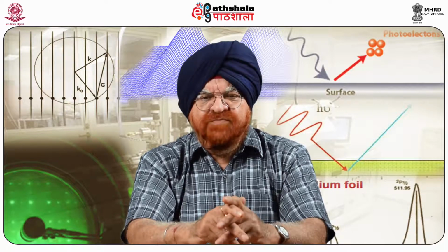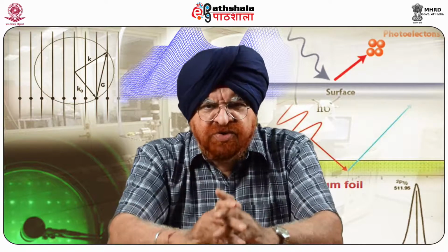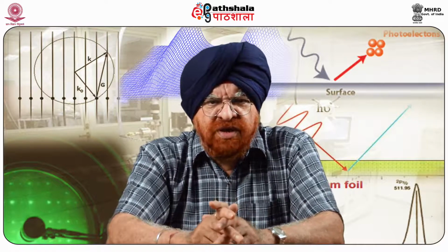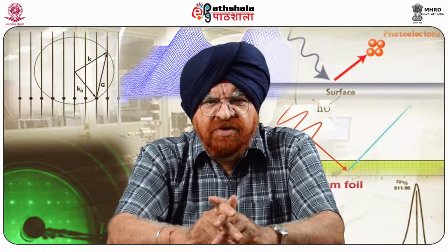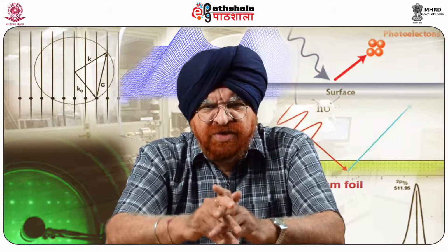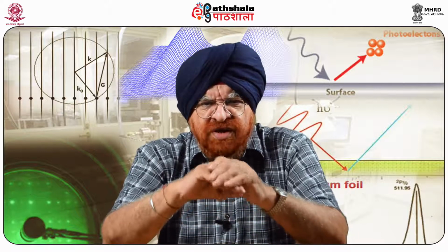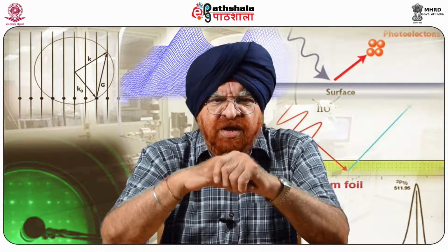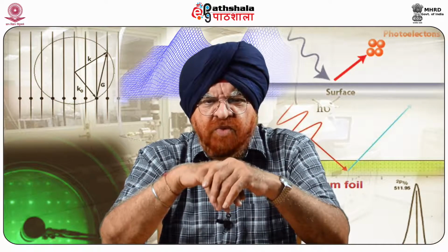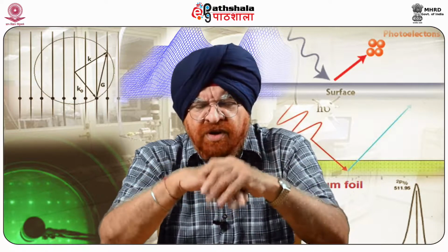This formula is the well-known result of a study called DMT, Derjaguin, Muller, and Toporov theory. In brief, as I said, it is called DMT theory, which assumes finite range surface forces and no deformation, that is, zero contact area at the moment when bonds between functional groups on the tip and the sample rupture.